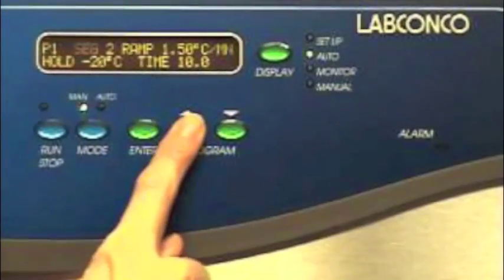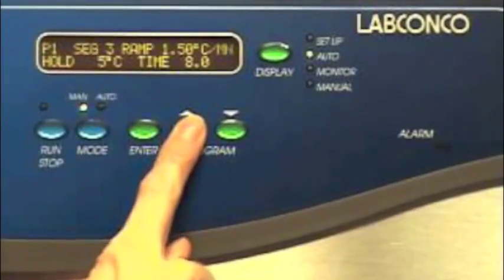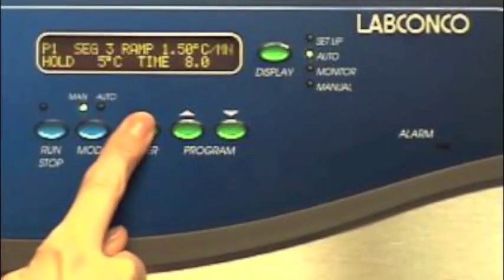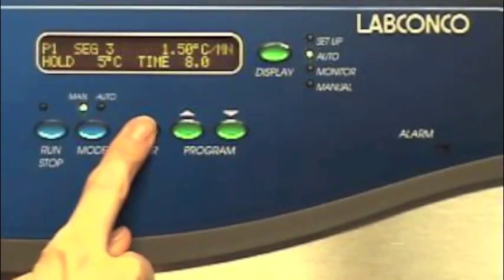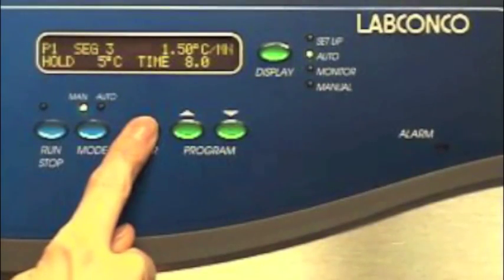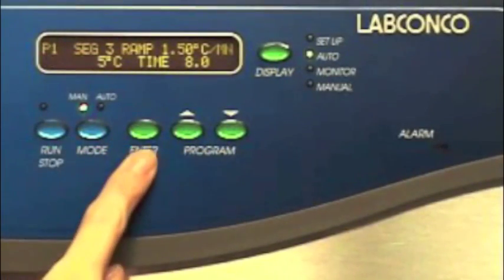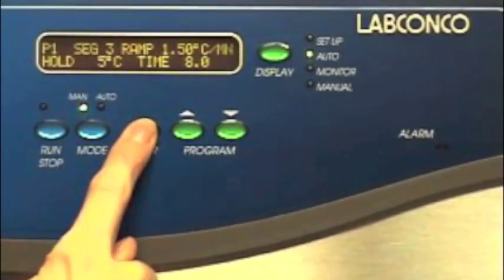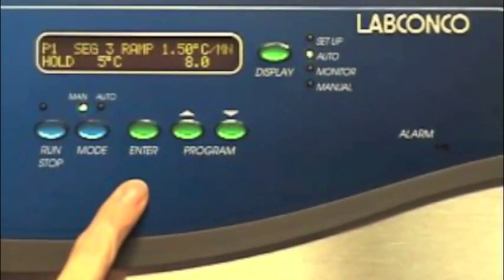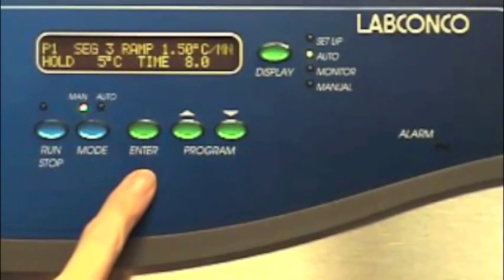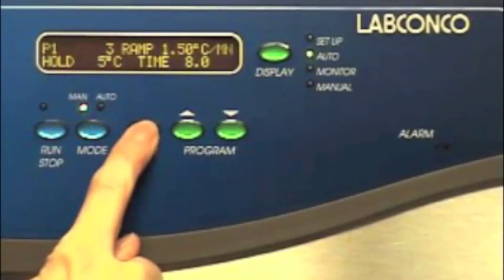Select segment 3. Enter and select 1.5 degrees centigrade per minute for ramp, plus 5 degrees centigrade for hold, and 8 hours for time. This completes segment 3.